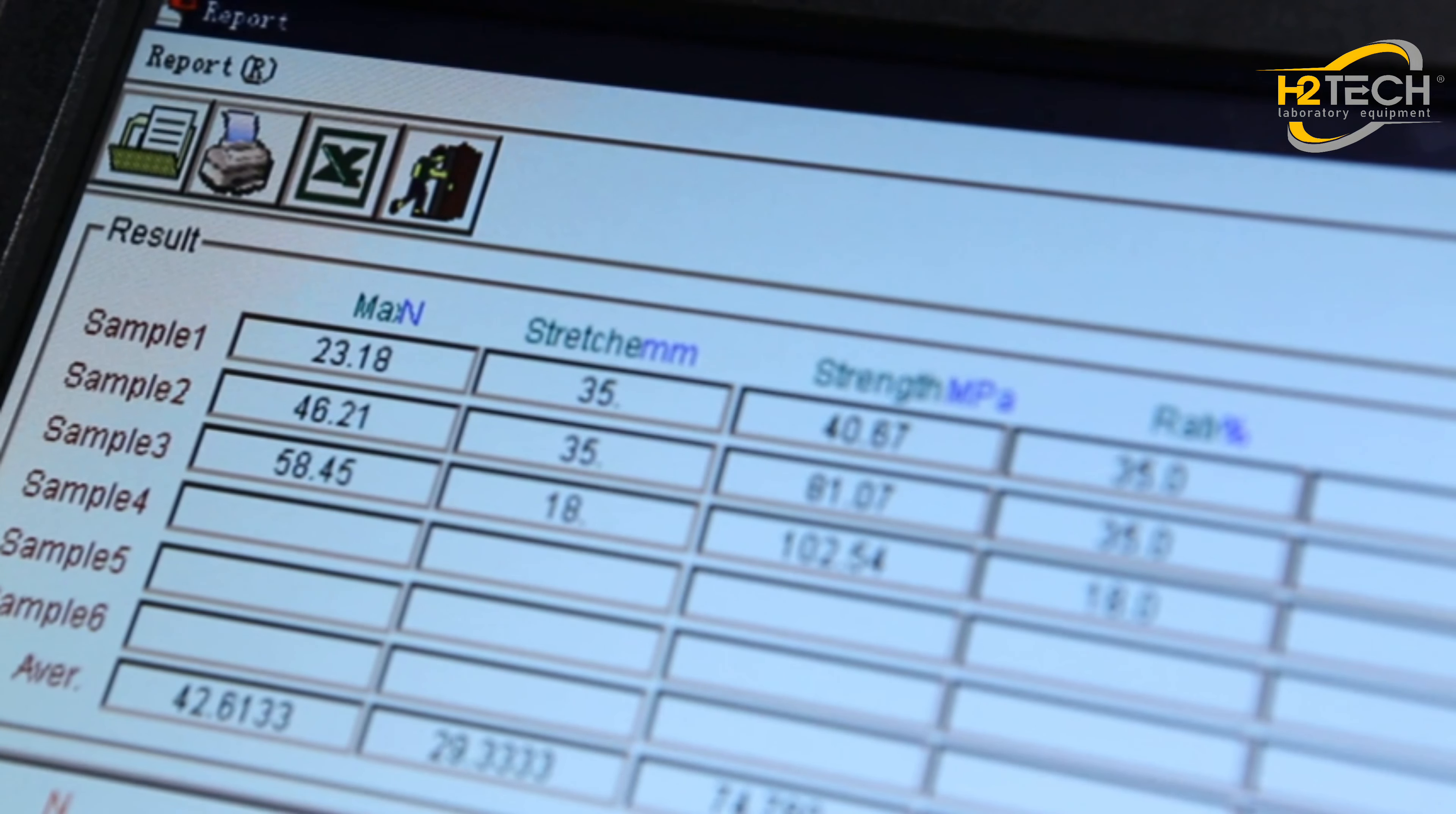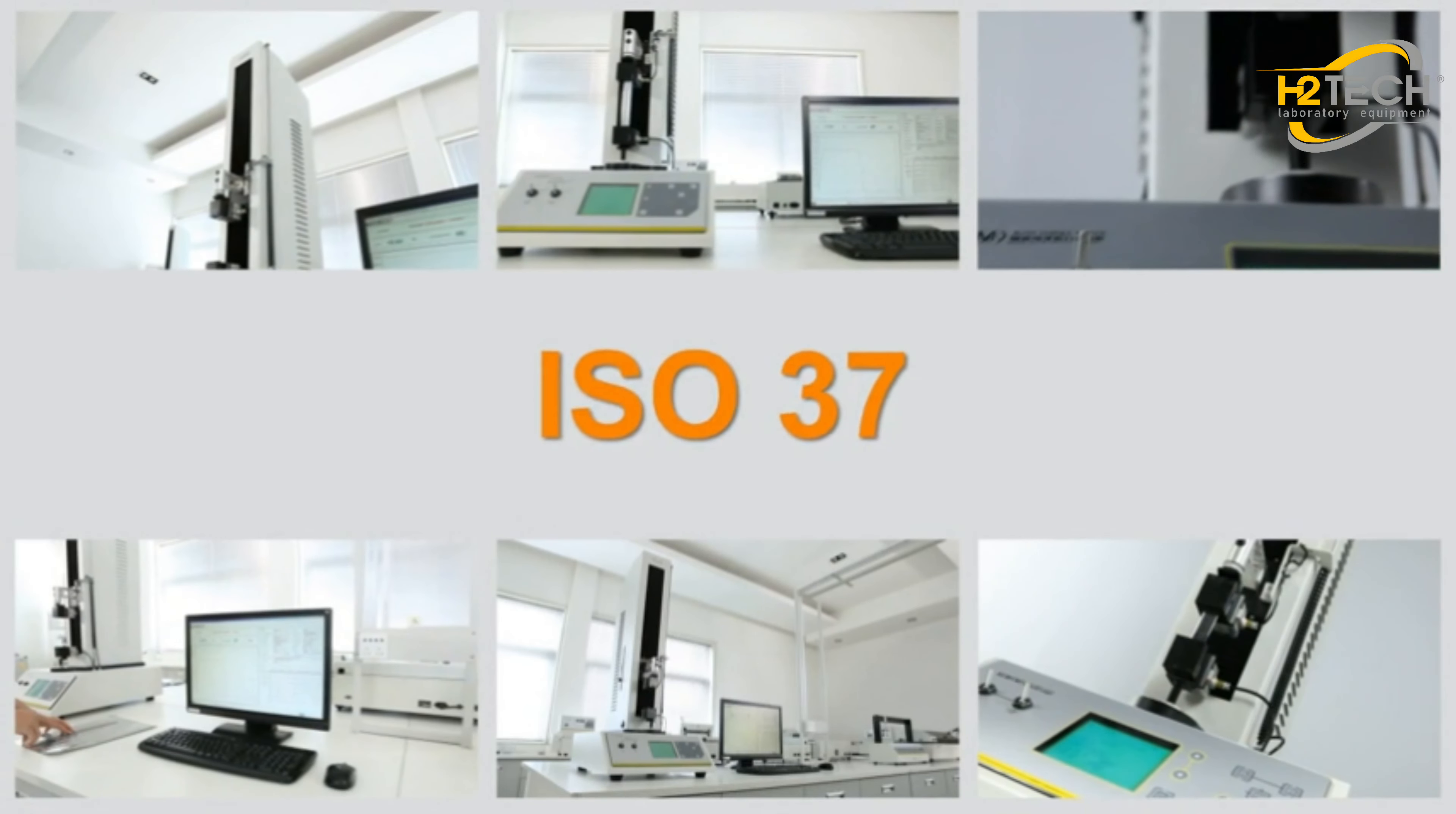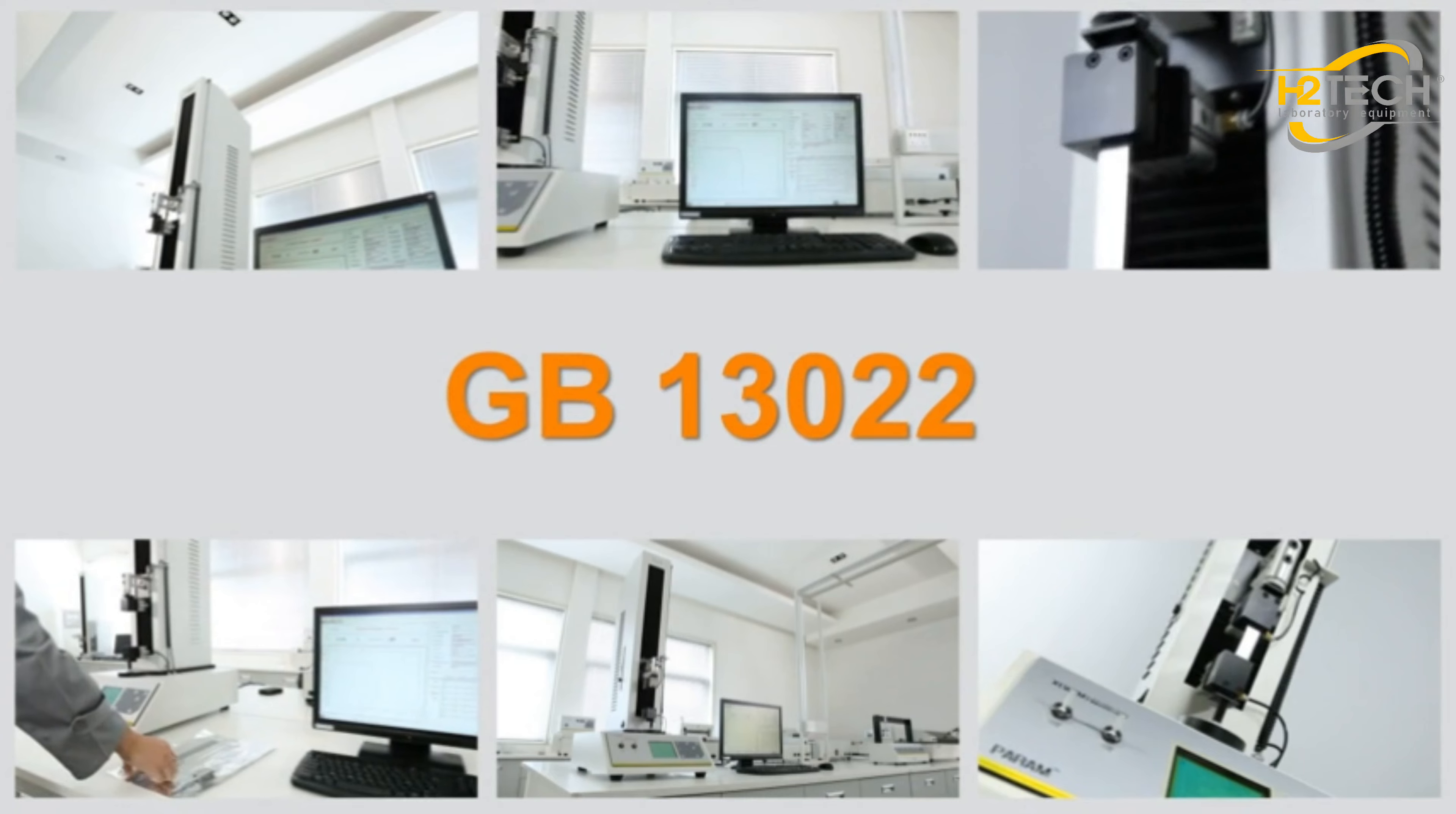It can carry out historical data comparison and curved superposition analysis. The testing principle complies with ASTM D828, ISO 37, JIS P8113, GB13022 and other standards.